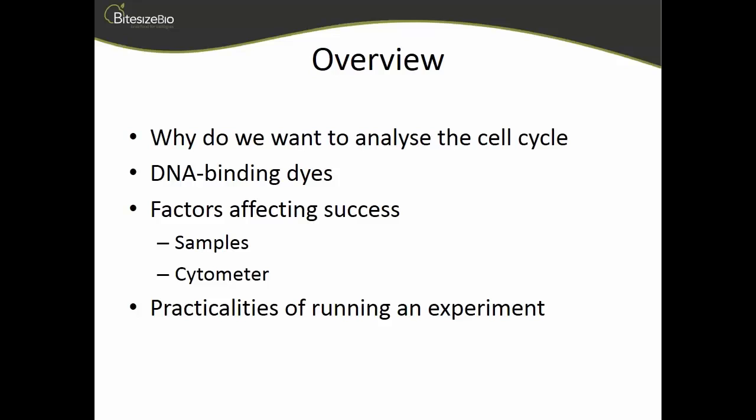And towards the end of the webinar, I'll talk a little bit about some of the practicalities of how we run a cell cycle experiment on our flow cytometer.